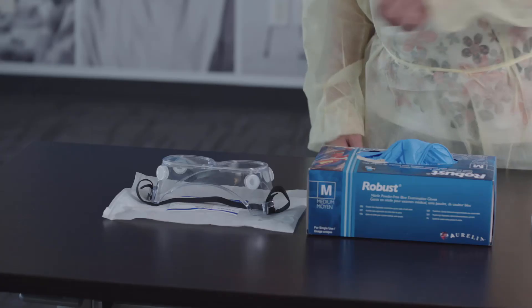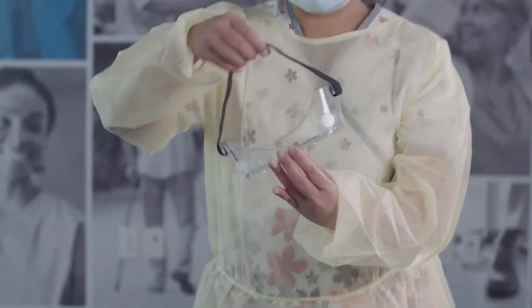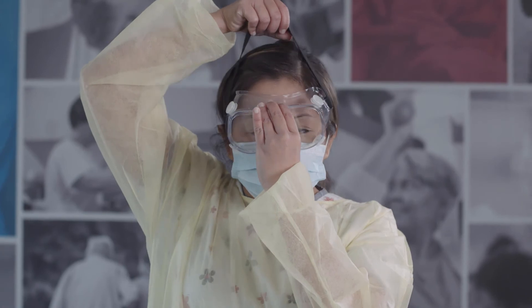You should do a seal check every time you don a respirator. Next, put on eye protection. This could be goggles or a face shield. Adjust to fit.